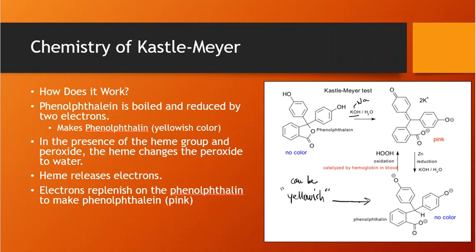And then that conjugates the system, so single, double, and we can go more inward into the molecule. This, what was a 5-membered ring, now almost in a way gets ready to turn into a 6-membered ring. This bond breaks with that carbon. You can see it dislodging itself from there, and it's getting ready to open itself up.